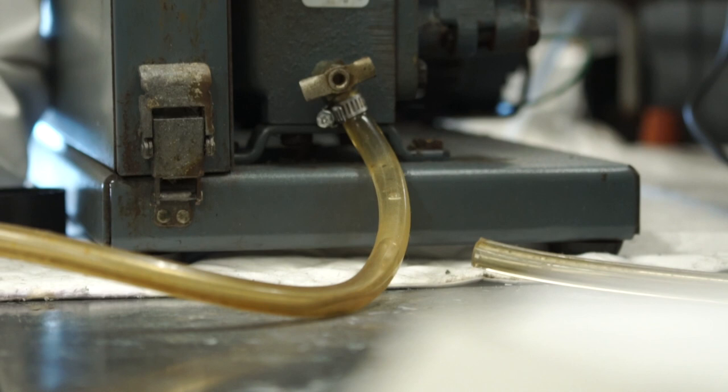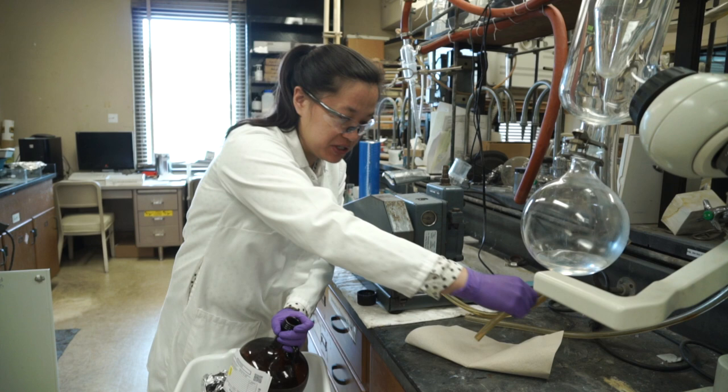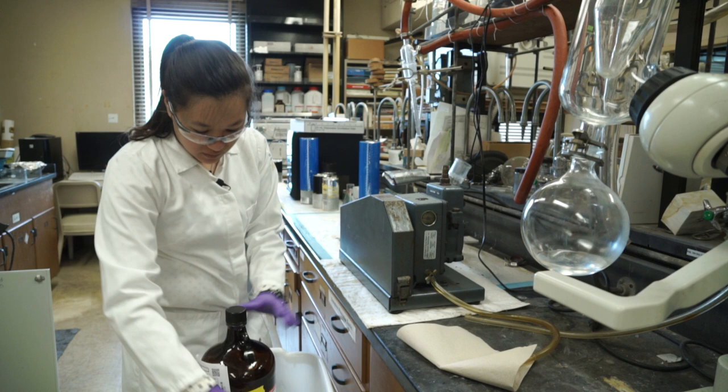Alright, so now that it is done draining, I am just going to sit this on a paper towel so it doesn't leak all over the counter, and secure my waste oil.